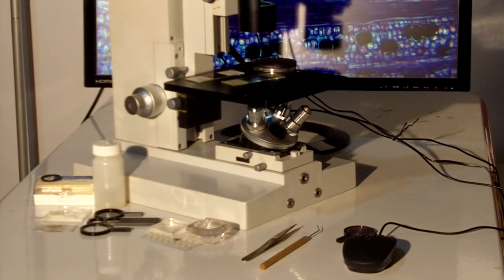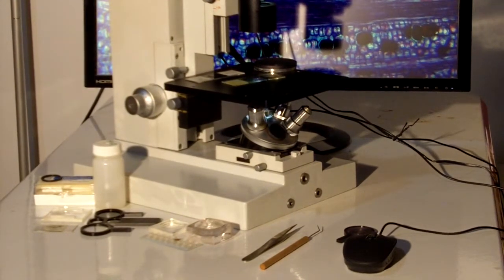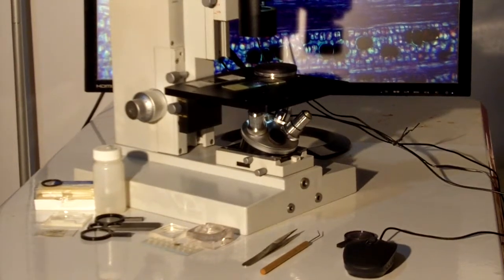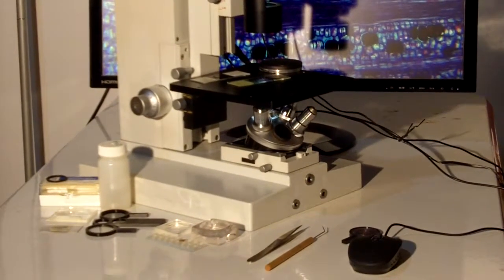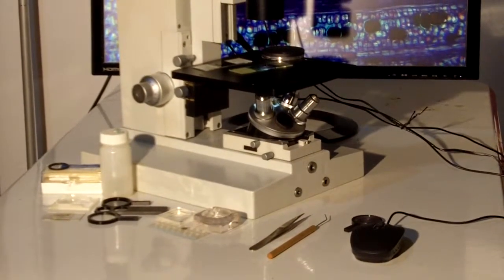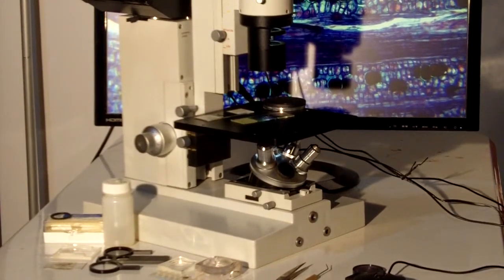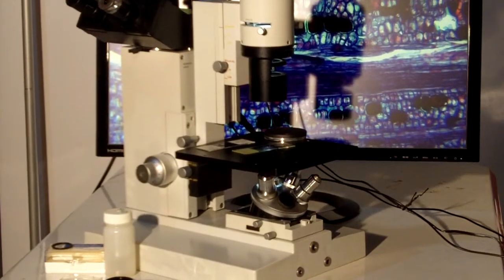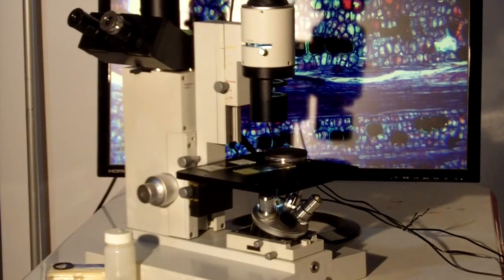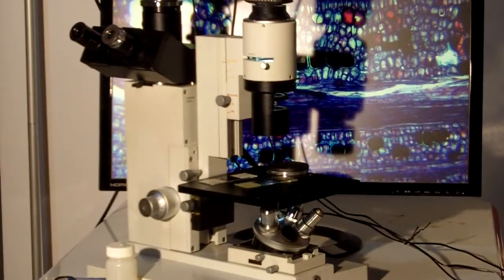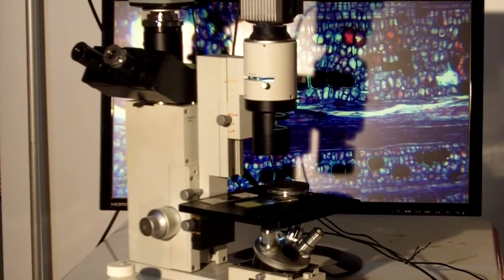Today I'd like to discuss the Leitz Diavert inverted microscope. The Diavert is set up to do live cell studies and it's an excellent choice for educational purposes because it'll do things optically you can't do with upright microscopes.